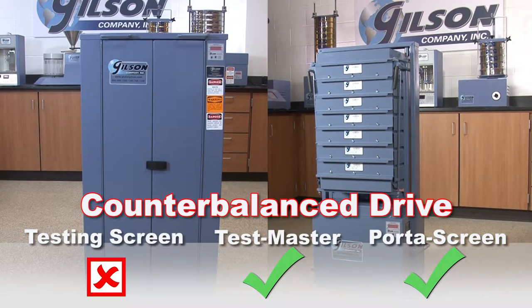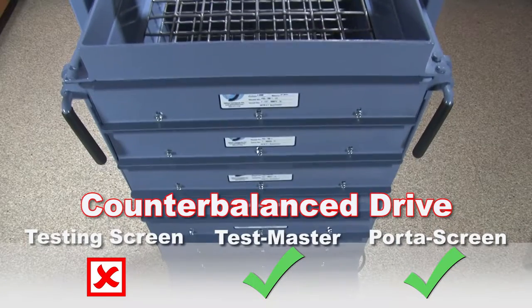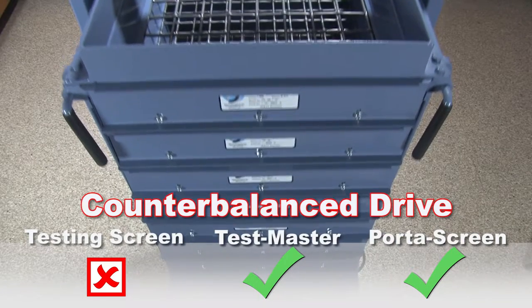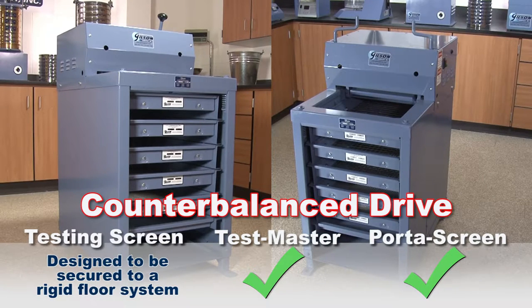Both the Testmaster and Porta screen models have a synchronized rotating counterbalance system for smooth, stable operation with no required mounting, whereas the testing screen models are designed to be secured with anchor bolts to a rigid floor system such as a concrete slab.